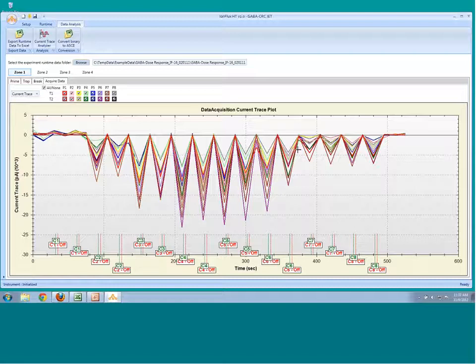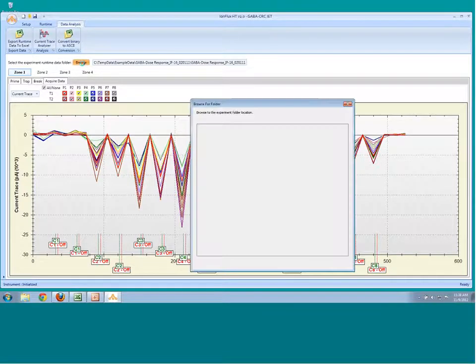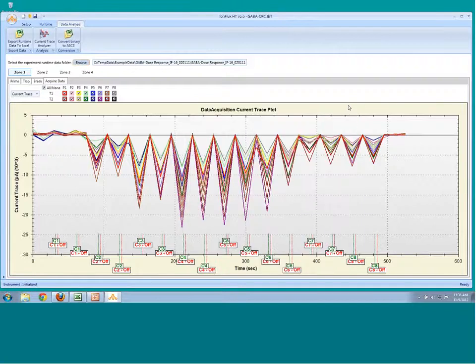And so this would be, again, a real-time IT plot that was collected over a period of about 10 minutes. And it has this strange sawtooth pattern. And as we take a closer look at this data, I'll highlight what this sawtooth pattern is coming from. So here I'm just taking a very quick look, and this browser is really designed to quickly go back and identify files once I have a number of different data files.